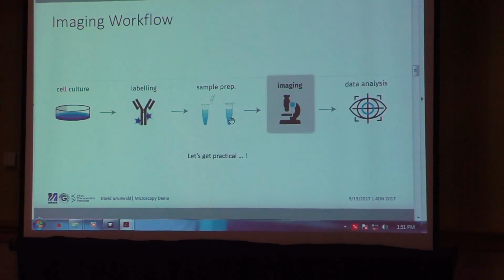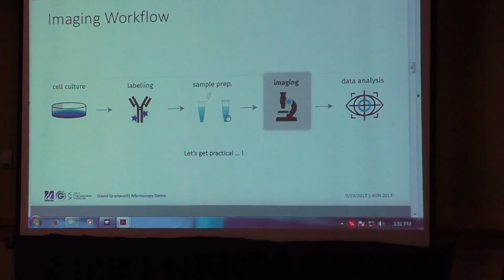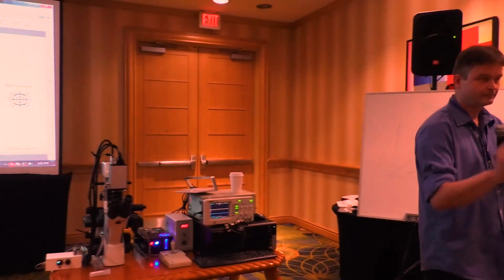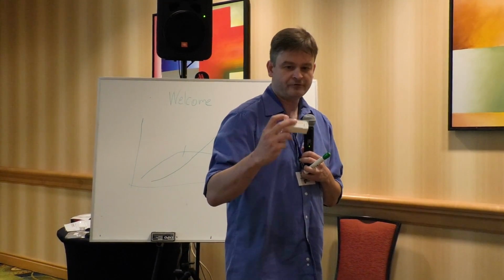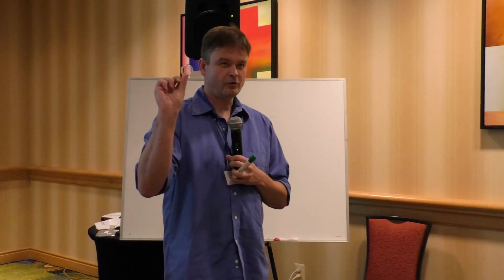Preparation. Well, let's talk preparation for a moment. So here, typical things to prepare with, right? This is just cover glasses. Fisher brand. Pretty good glasses. 0.15, 0.17, whatever the spec is. Okay. It's more comfortable, right? Glass bottom dish, high resolution imaging, different glass.